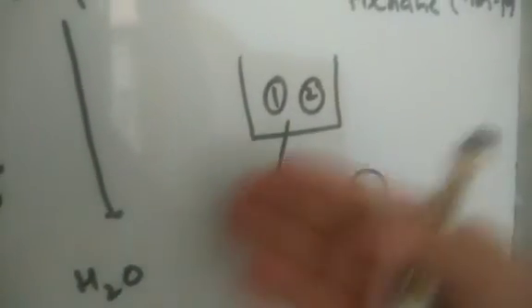Fine. Now if we have the same sample and this type of setup, we know P1 is more polar. That means it will go more into the mobile phase, because the stationary phase has its surface modified with non-polar compounds. It is more partitioned in the mobile phase. This mobile phase is flowing through under high pressure, so this compound will come very fast. So we'll get compound P1 first, then we'll get compound P2. And the pressure is also high, so we'll get them very fast. So this is actually what is present in high performance chromatography.